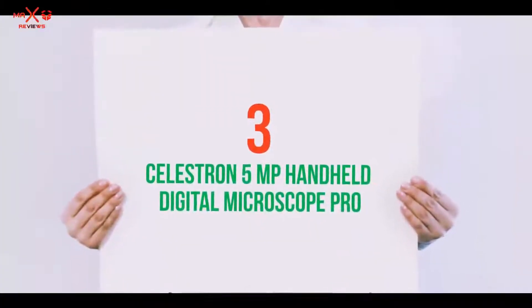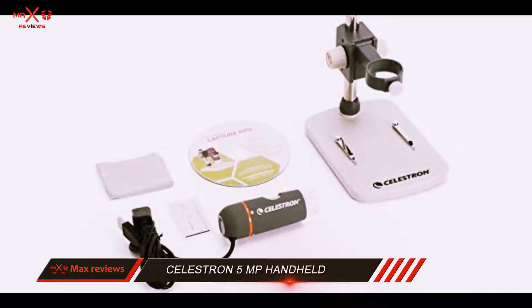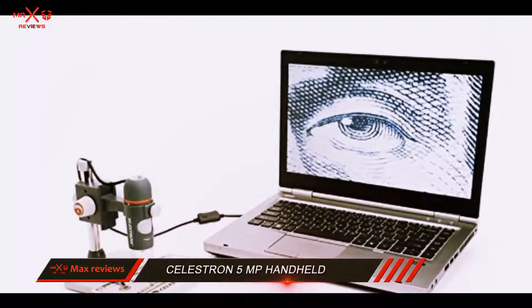Starting at number 3: the Celestron 5MP Handheld Digital Microscope Pro. Having a 5MP camera, not many digital microscopes can come near to the Celestron when it comes to producing a high quality image.